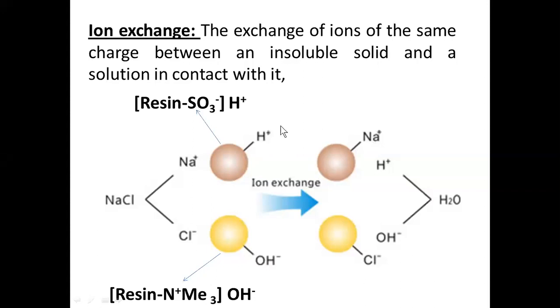So all those hydrogen ions have been replaced by sodium ion, in order to convert the resin which was present in the hydrogen ion form into the sodium ion form now. And the hydrogen ions which have been replaced by sodium ion go out of the chromatographic column during the elution step. So these hydrogen ions will be coming out from the chromatographic column. The quantity of hydrogen ion released from the chromatographic column is with respect to the amount of sodium ion, or amount of cations, which have been replaced in place of hydrogen ion.